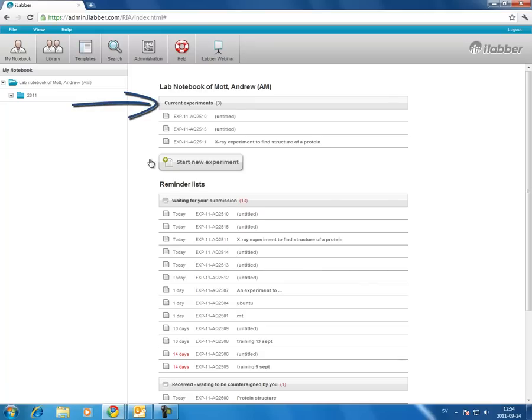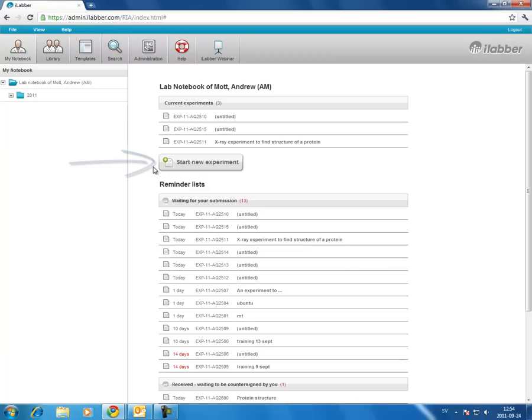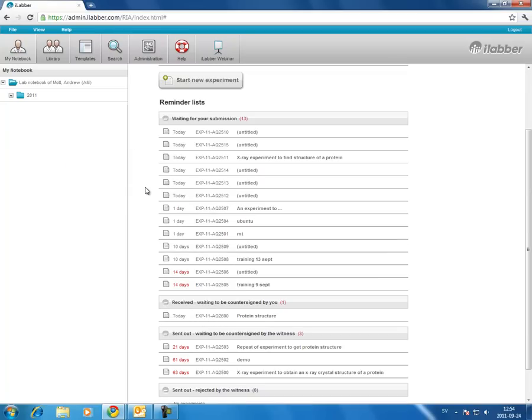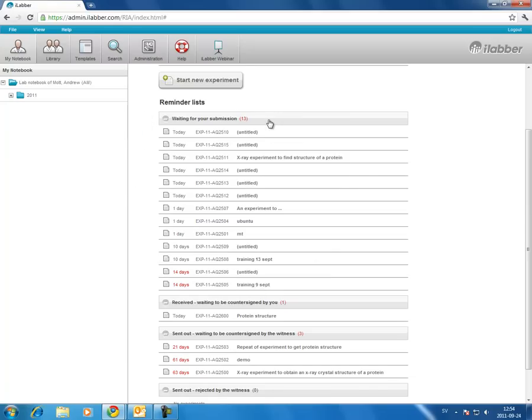At the top we have the most recent experiments you've been working on. Then we have the start new experiment button, used to start a new experiment. And then we have reminder lists. The first of these is a list of the experiments which you've started but not signed yet — a reminder that at some stage you should sign and lock these experiments.